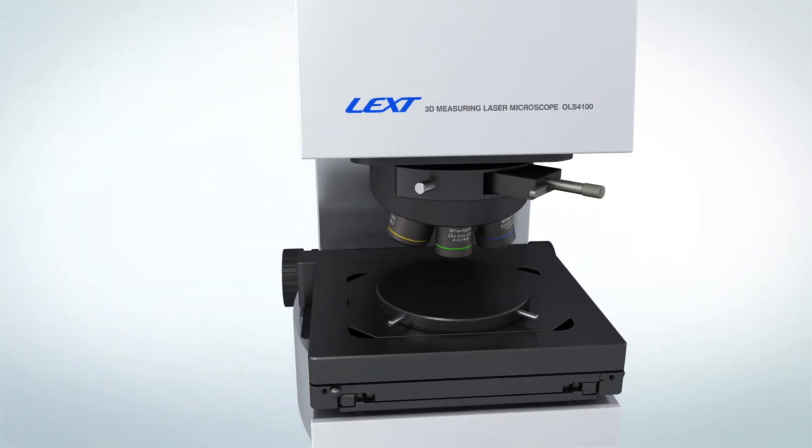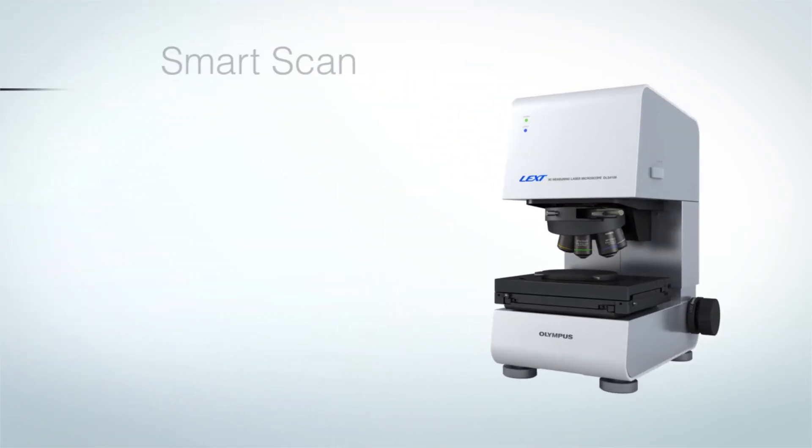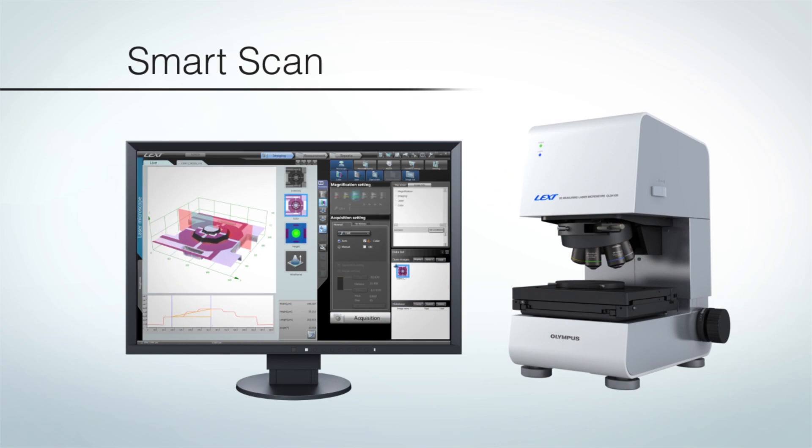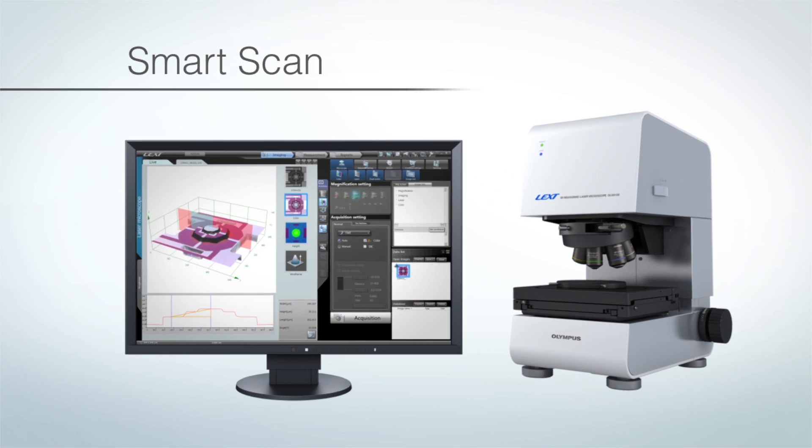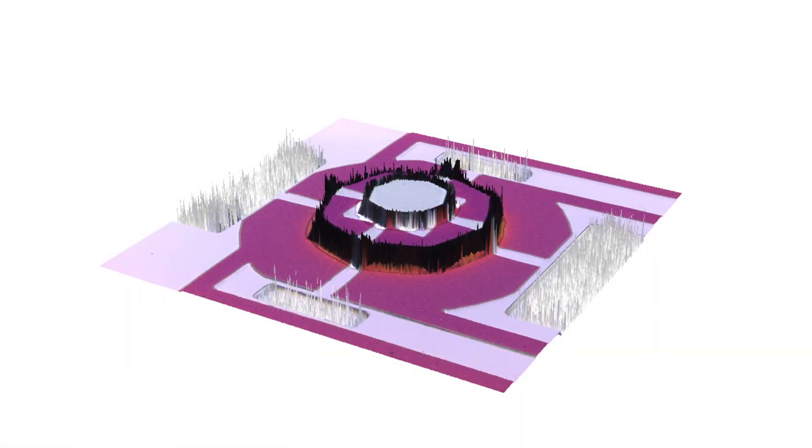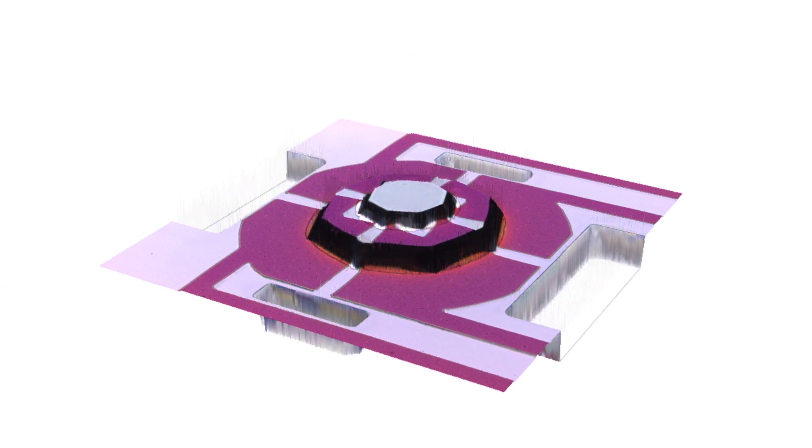Do you think it's difficult for a new user to obtain high-quality images and accurate measurement with a laser microscope? The LEXT OLS4100 can acquire the optimum image with a single click.